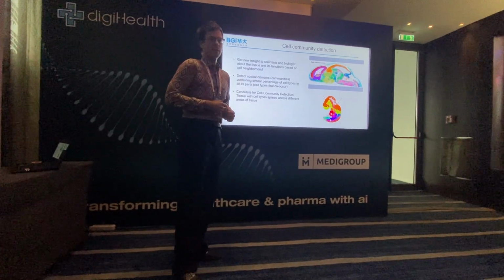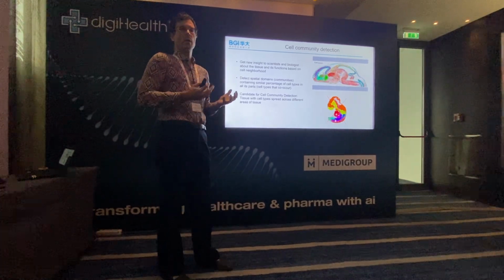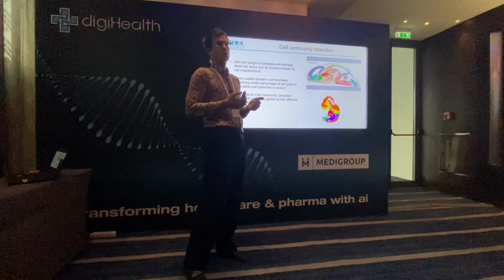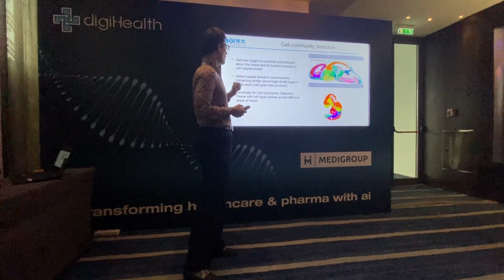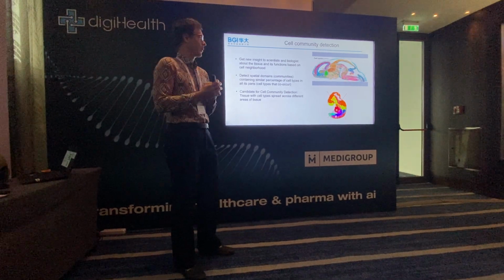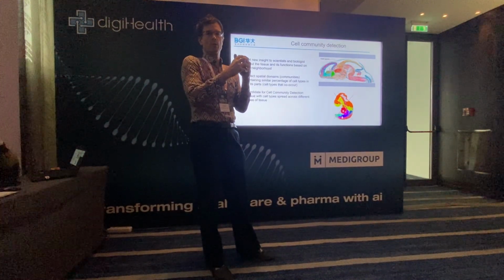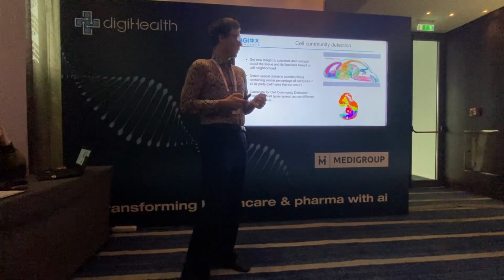And when we have these cell type annotations, what can be done with them next? We want to get more insights. We want to identify some functional regions of interest which can be connected to some structural change or to some function of that tissue. So here we decided to use this mixture of the cell neighborhood that is present. As you can see here in this sample, you have large mixtures. So different cell types exist very close one to another, and since they do that, they probably do some common function together.